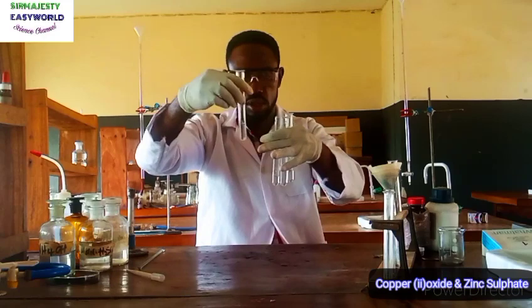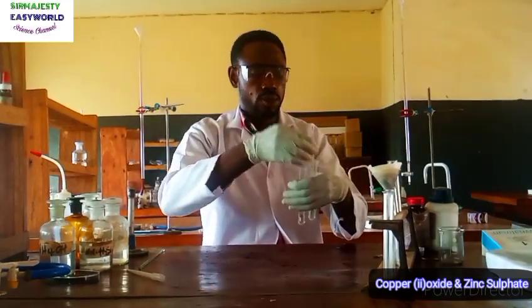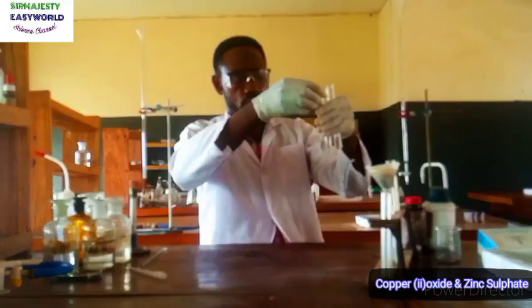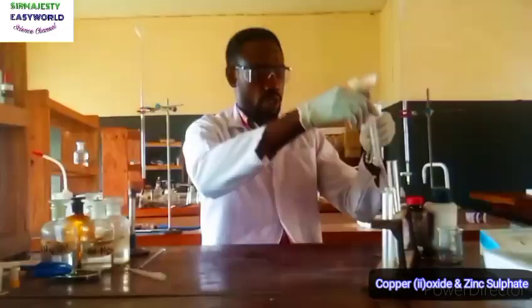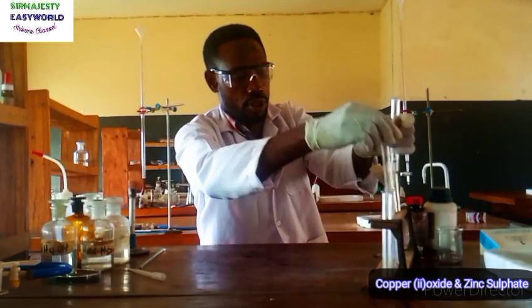Just into 3 portions. We have the stock solution here. Let me bring these out. These are my 3 portions.